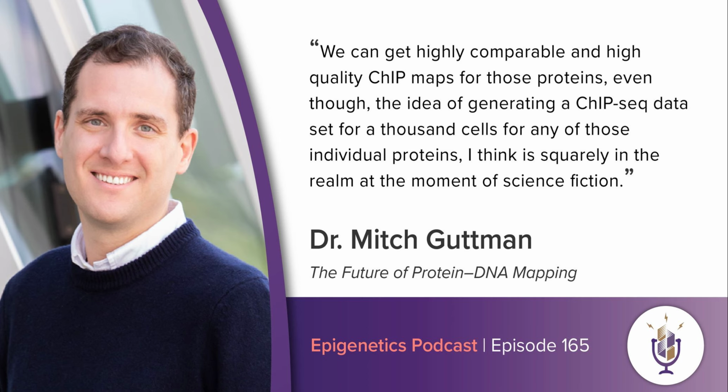decreases exponentially, so much so that we can ensure that the probability of what I'll call a collision, that is, two distinct molecules not on the same bead getting the same barcode, is very unlikely, vastly lower than the total number of molecules and beads in our sample. And that then allows us to sequence the series of tags, which we call a barcode, that are on the oligo and on the chromatin, and match them up. So if they have the same barcode sequence, they must have been on the same bead.